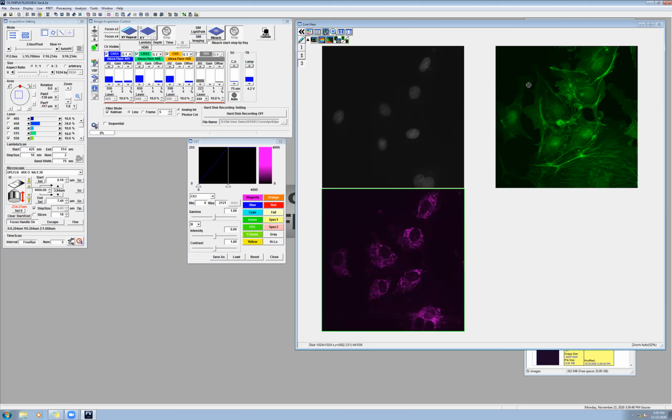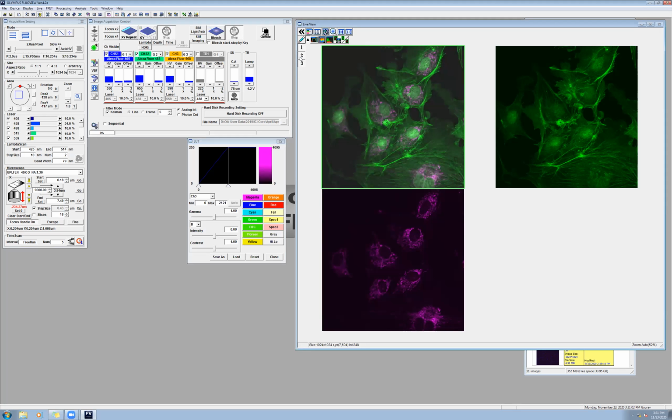And if you want to look at all the merged channels, you can click on one of these windows. Let's say if I want to merge everything in this window, you can see the green border around the window. And once you see that green border around the window, you can turn this on or off, and you will get this visualization. Similarly, if you want to put those two channels over here, you can bring them together and so on.